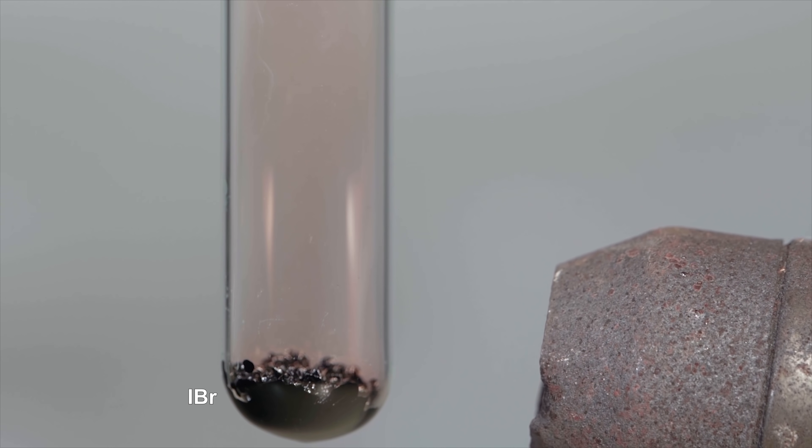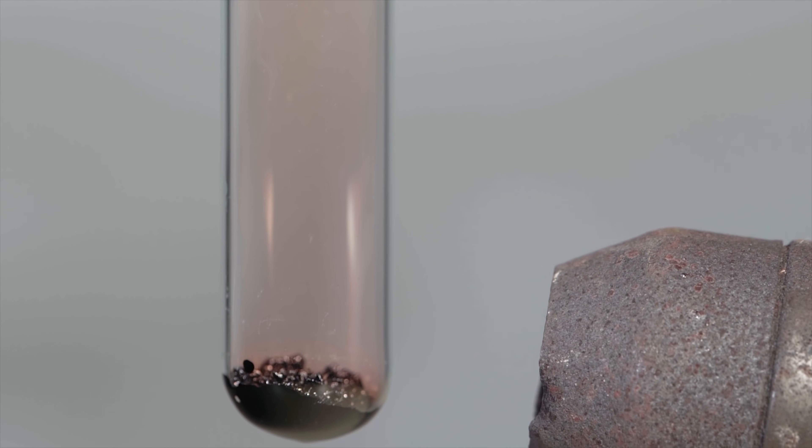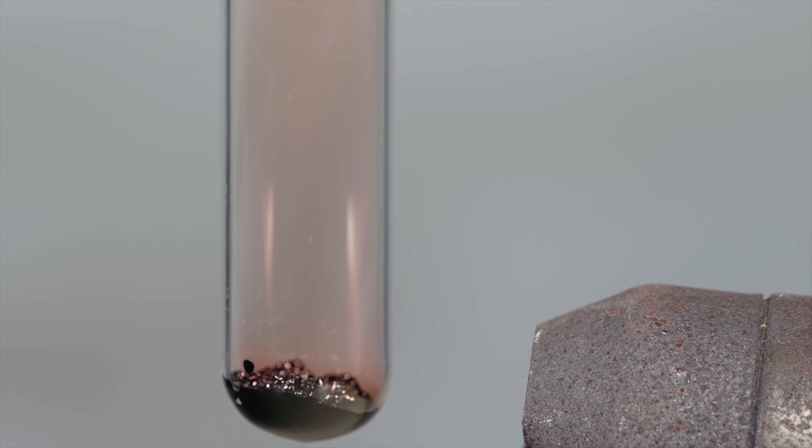You all know that aluminum reacts with bromine and iodine quite violently. So let's check its interaction with iodine bromide.